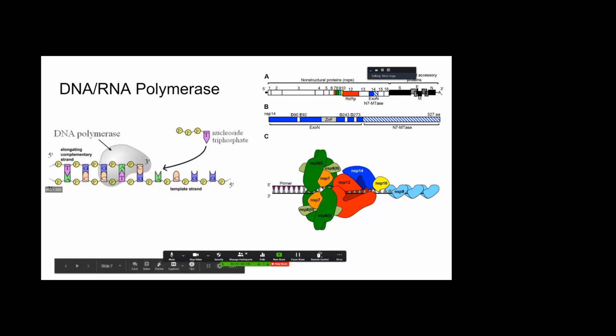But the test I'm going to talk about here is going to be using polymerase in a test tube. So it's not in a living thing, it's in a test tube. And that's the polymerase chain reaction.